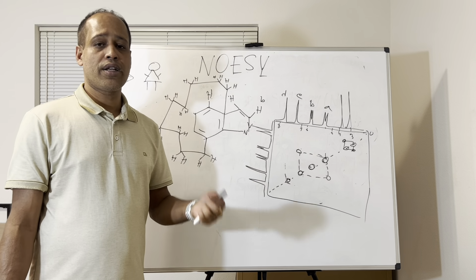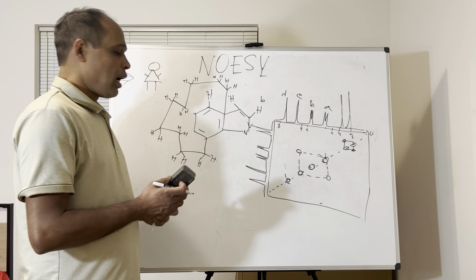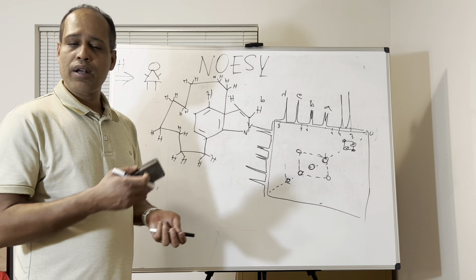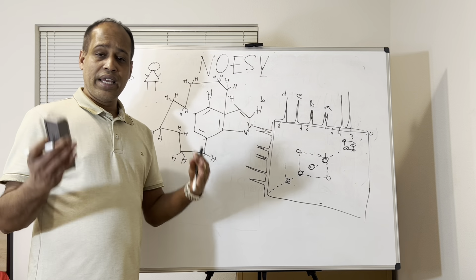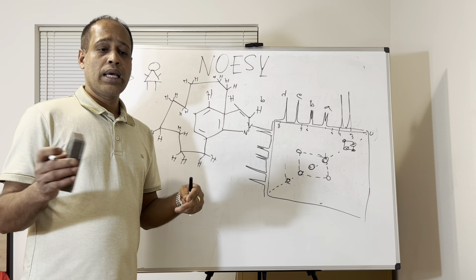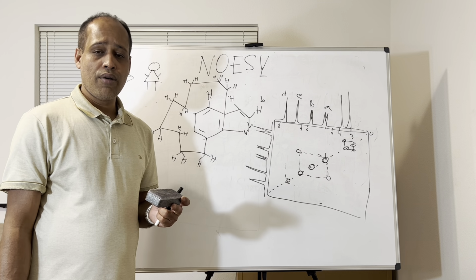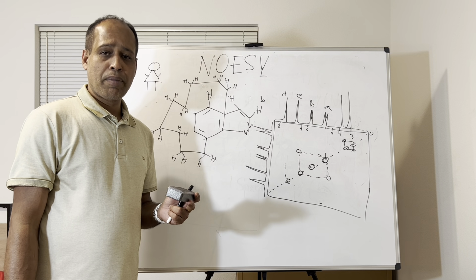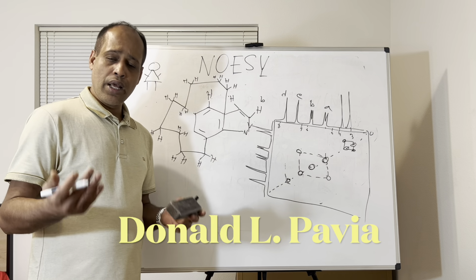That's how scientists or researchers do their structure correction. So if you have any question about the NOESY, definitely you can read; there is tons of literature or papers or things on the internet, Google, or the spectroscopic books. Especially if you want to understand it in a really good way, then you can read a book, Introduction to Spectroscopy, written by Pavia. Okay, so that book is really good.